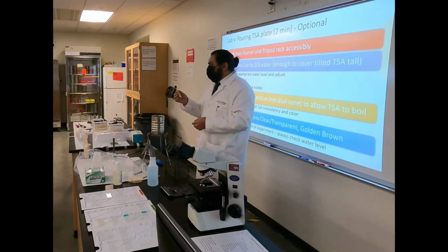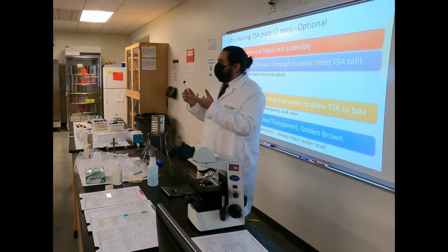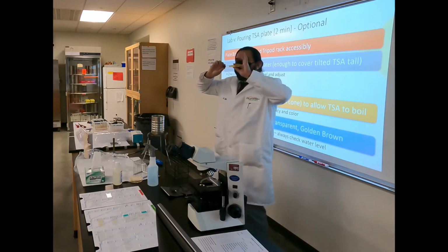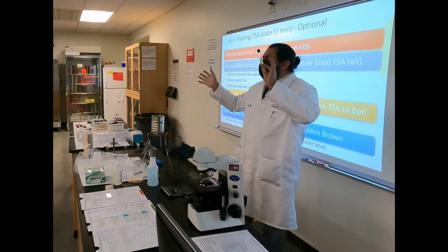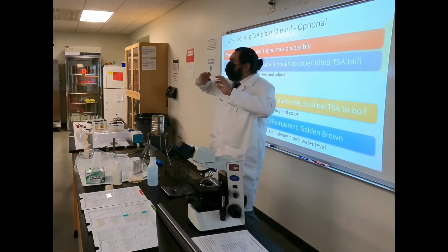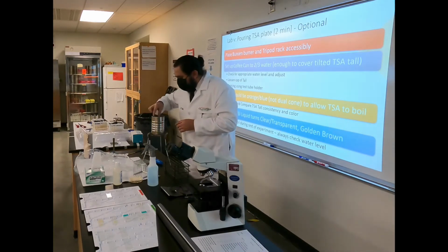Now, because this is a tube, two things. It has a cap on, which means that if you boil this, boom, loosen the cap. So all you need to do is about half a turn. So you're doing this, and that's it. It won't fall off, trust me. Not completely loosening it off, just a half a turn, quarter of a turn, should be enough. Place it inside your can.